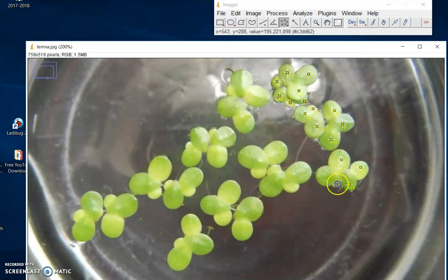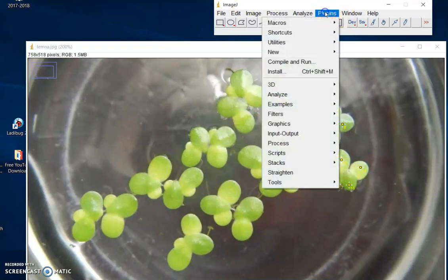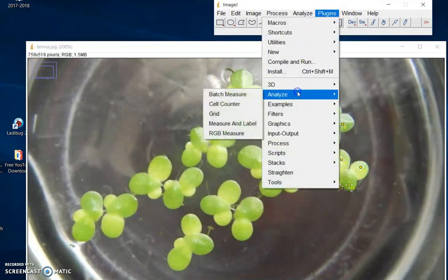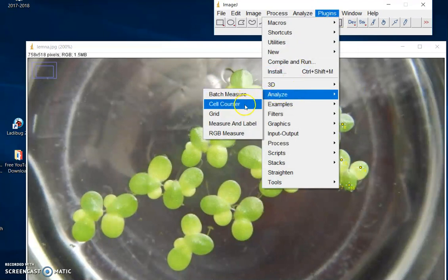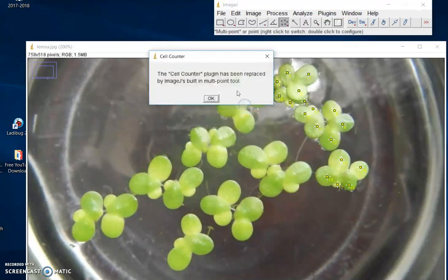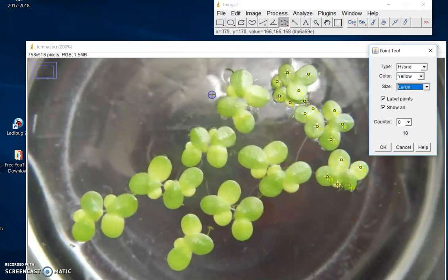That's a little frond down there. Plugins, Analyze, Cell Counter — and I'm up to 18 fronds. You get the idea.